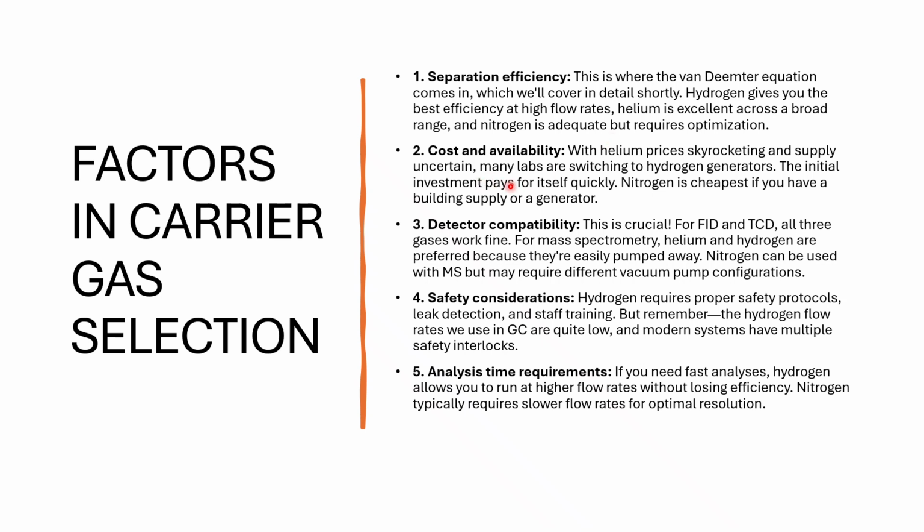Second factor is cost and availability. With helium prices skyrocketing and supply uncertain, many labs are switching to hydrogen generators. The initial investment pays for itself quickly. Nitrogen is cheapest if you have a building supply or a generator.